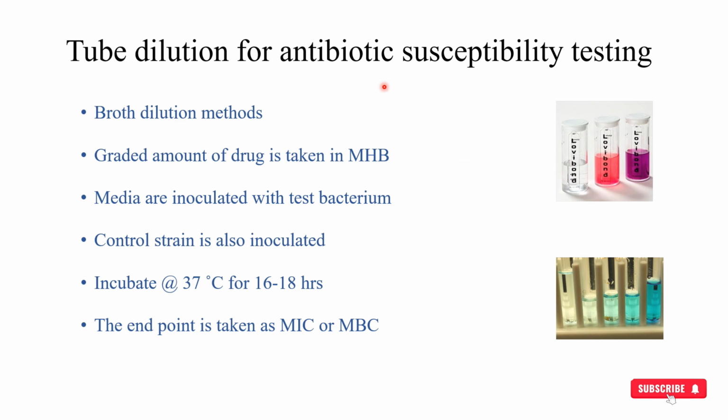Tube dilution for antibiotic susceptibility testing. This tube dilution is also called the broth dilution method, because here we are using liquid media.